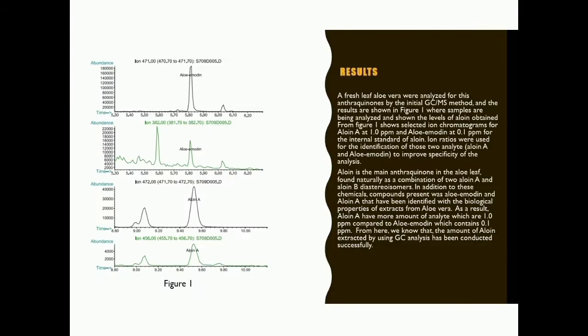For the results, fresh aloe vera leaf was analyzed for these anthraquinones by the initial gas chromatography mass spectrometry method, and the results are shown in Figure 1, where samples are analyzed and show the level of aloin obtained.